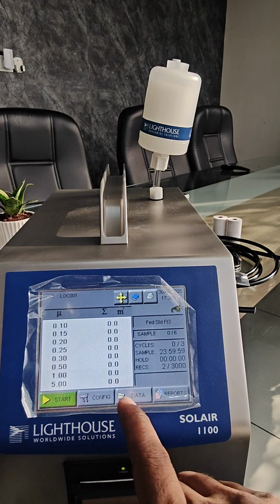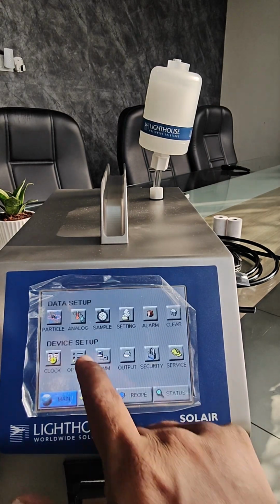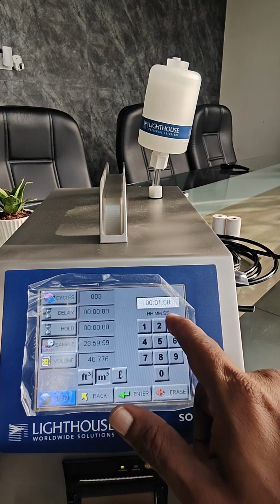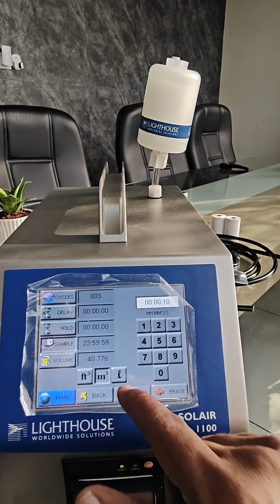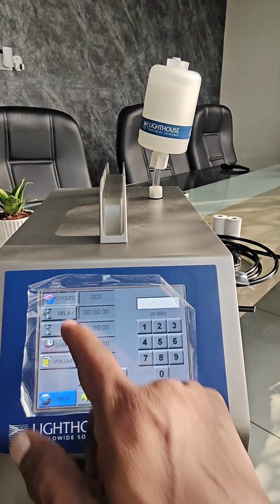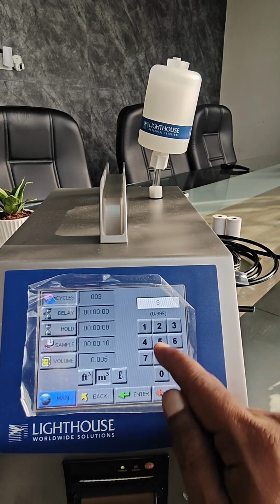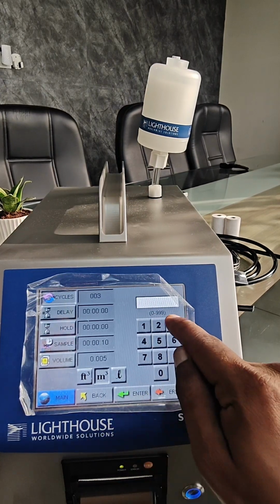Okay, it is the sampling time. We can change it. 1 minute is more than enough, so you can erase. Sorry, you can have 10 seconds. Okay, just a small cycle, we can change to 1. Okay, 3. Okay, 3 is required.